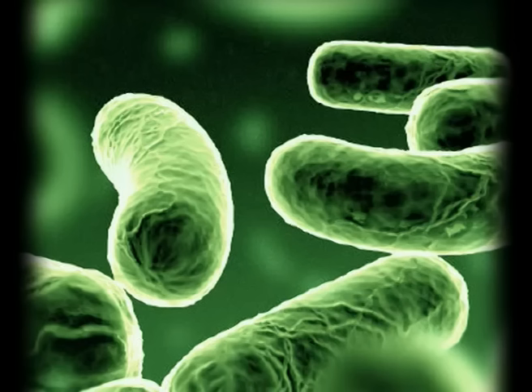After it shows growth in the liquid culture, it can be tilted over the solid medium present in the same bottle, allowing subculturing of bacteria on the solid phase. So this prevents the need to open the mouth of the bottle for frequent subculturing, which can lead to contamination of the culture.